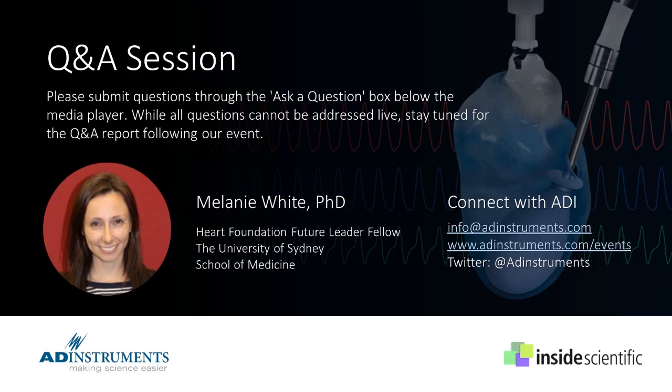Obviously, the condition of the heart, that's not something you're actually going to know until you excise the heart. Animals aren't great at letting us know when they're not well, but we have a better chance of understanding that after we've excised the heart from the cadaver. The last one, and this is something we learnt the hard way, keep your perfusate reservoirs closed. You can introduce so many sources of dust just by having those reservoirs open. So keep them closed at all times.